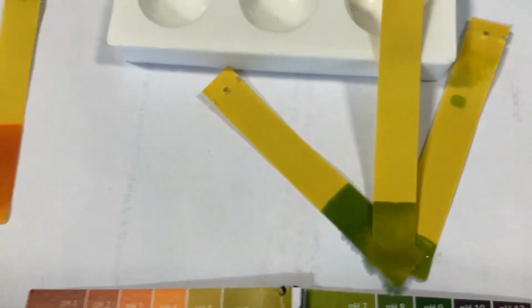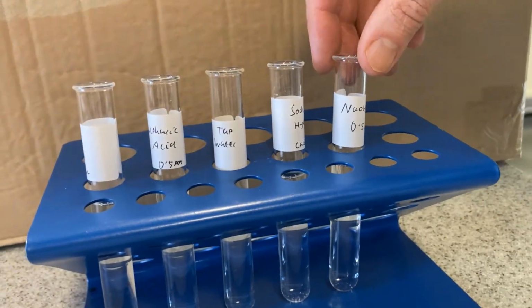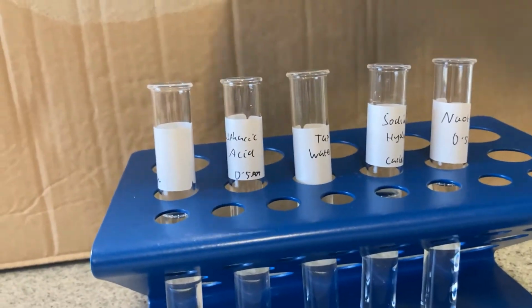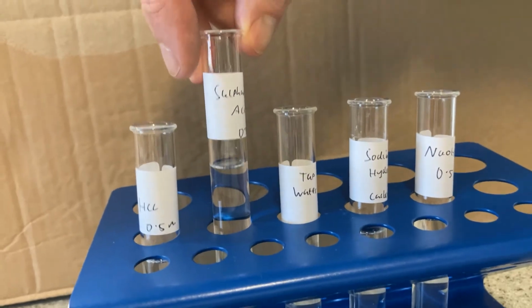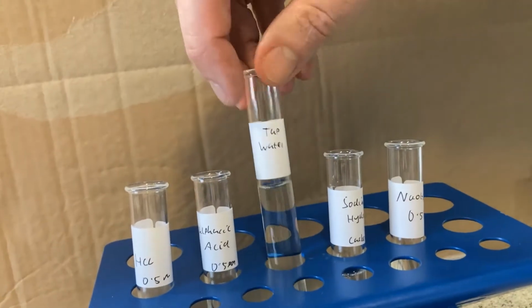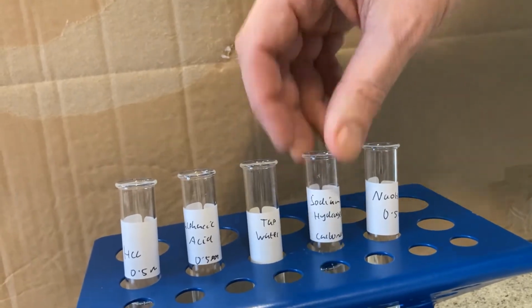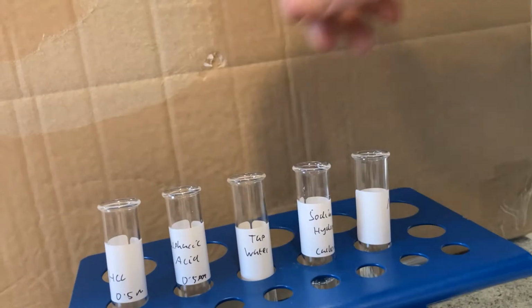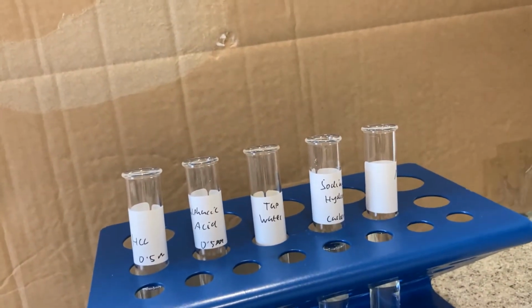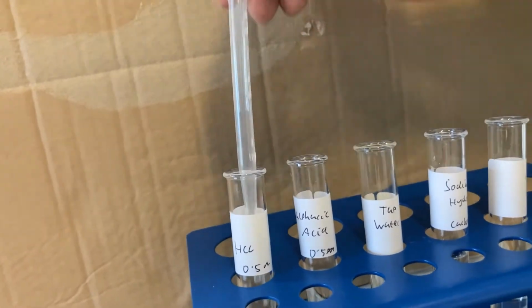Now I've actually got several more things here. These are things we find in the laboratory. We've got hydrochloric acid, we've got sulfuric acid, tap water, sodium hydroxide. Hydroxide means alkali. And we've got some more alkali there as well. So, let's have a quick go. I'm going to quickly pop these out. Doing it super quick now.